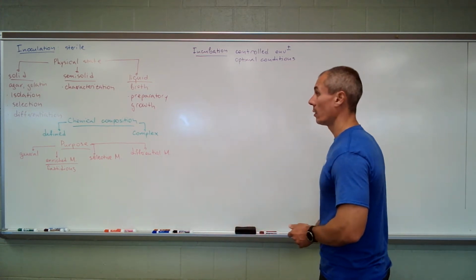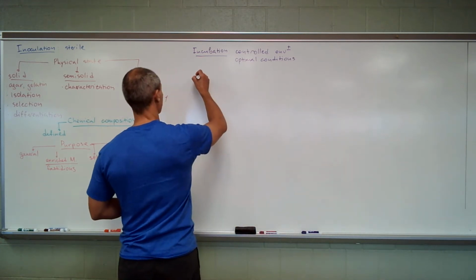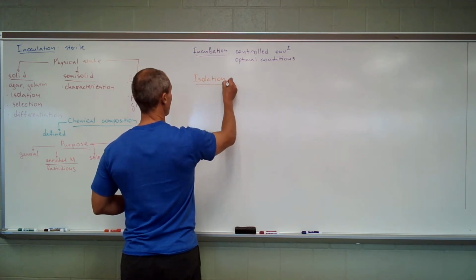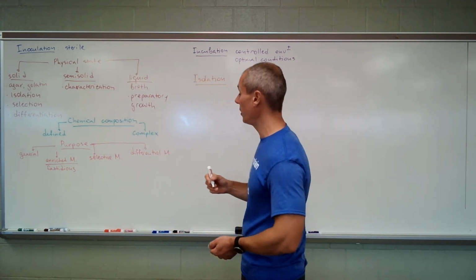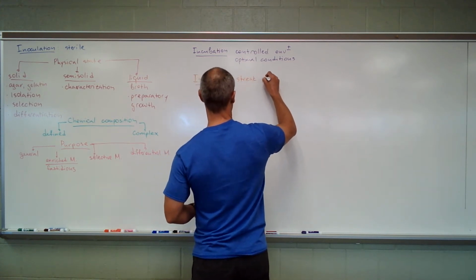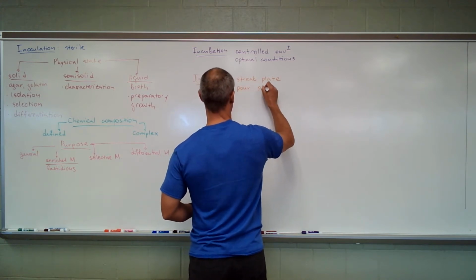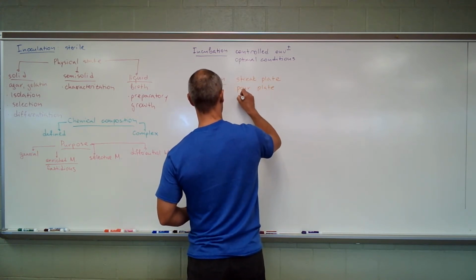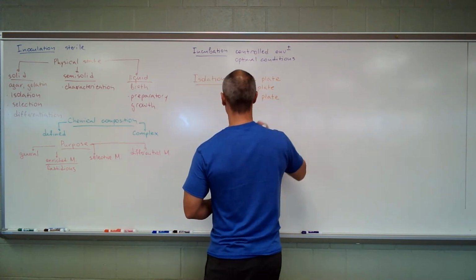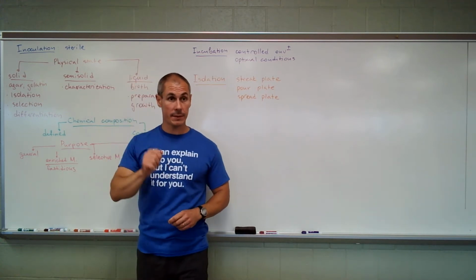Now, the third I is isolation. There are 3 main techniques of isolation, and I will briefly describe them. It's the streak plate, pour plate, and the spread plate. You're literally going to be doing streak plate next Tuesday, okay, with your results from there.